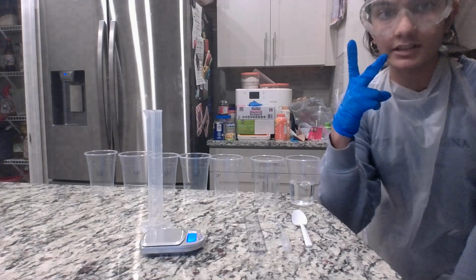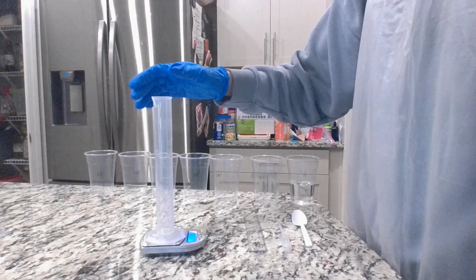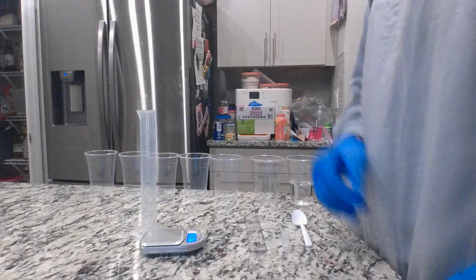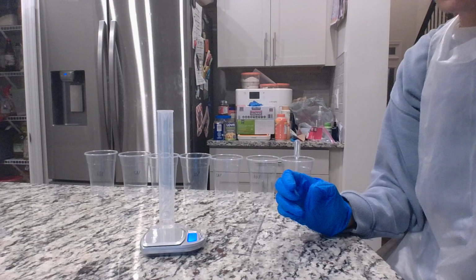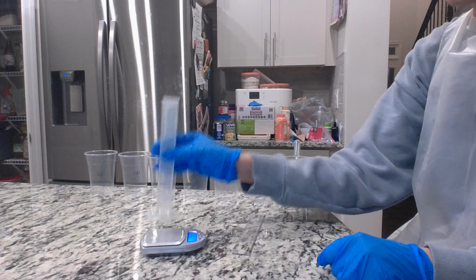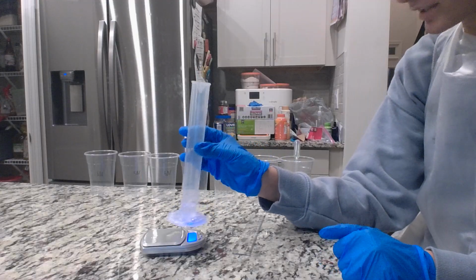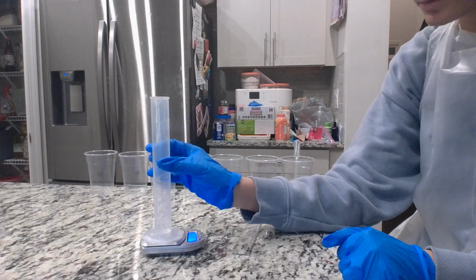This is activity 2. This is 5 milliliters of 0% sucrose water.